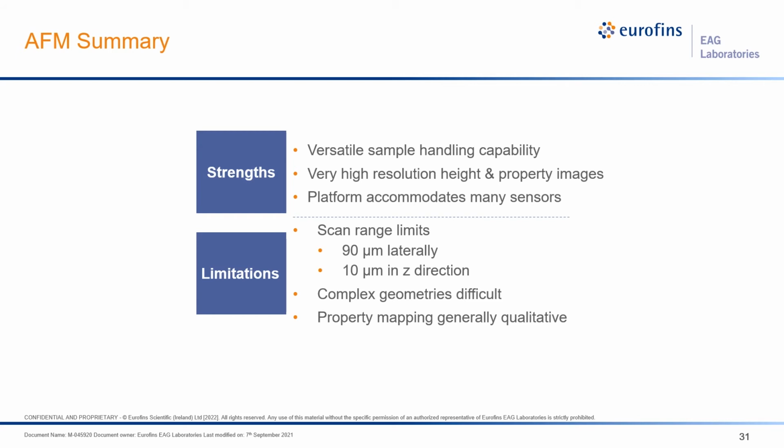AFM can also image material, electrical, and magnetic properties by incorporating various sensors into the experiment. It is, of course, limited to smaller analysis sizes, and the property mapping is generally qualitative.